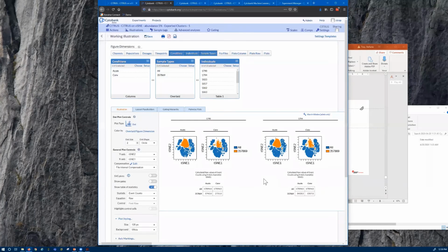I want to clarify that there is no statistical method that will allow you to adjust for the p-value after you're doing some kind of testing with an unequal group experiment. But what you can do is pick the right statistical method to do that.